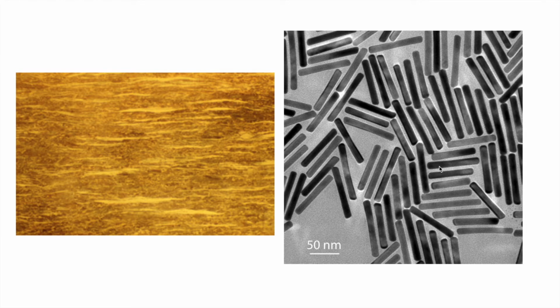And so some crystallographic planes are going to have a much higher intensity than we would expect if we have a random mix of our particles and random orientations. So this is very strongly preferred orientation of these rod-like nanoparticles. The same thing can happen in both of these types of samples.